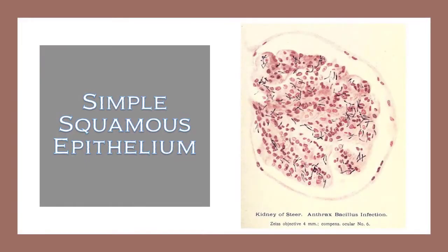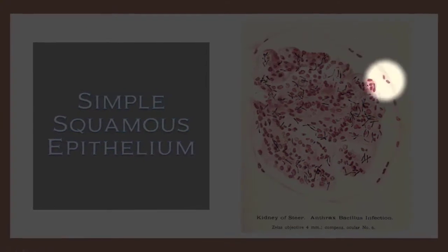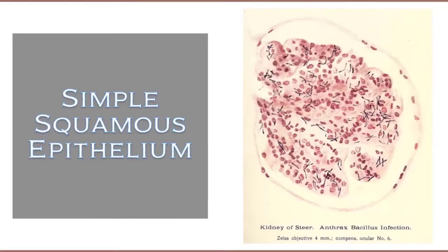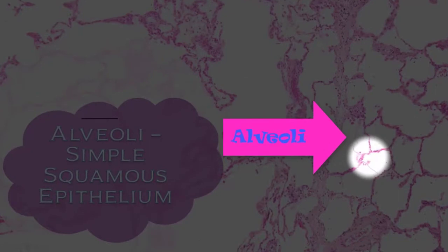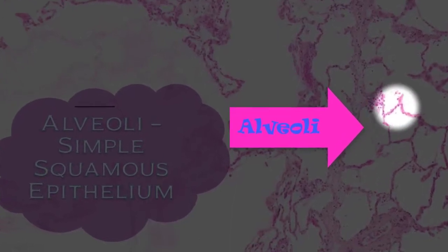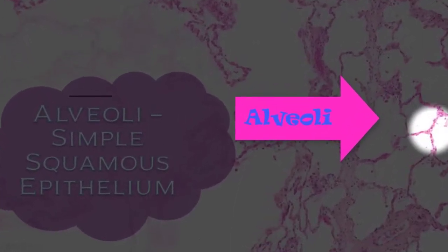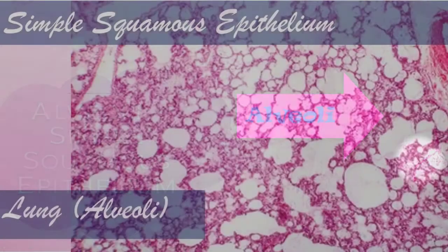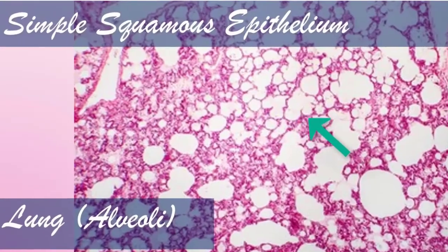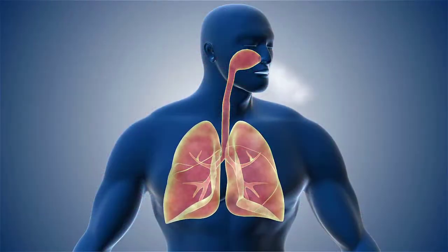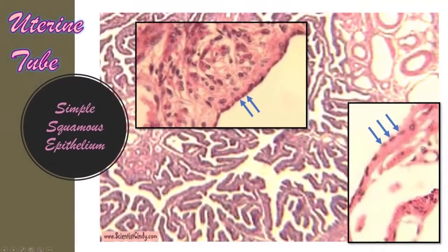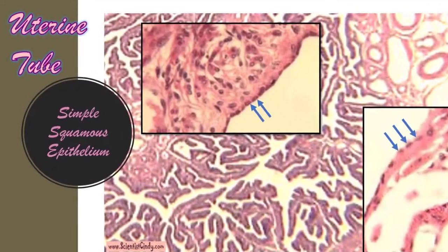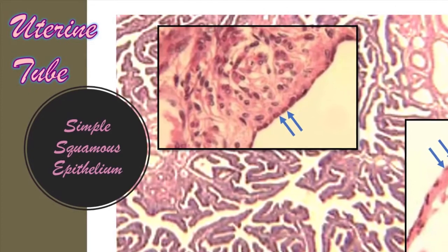We also have simple squamous epithelium that lines the Bowman's capsules in the kidneys. The alveoli of the lungs are also surrounded by simple squamous epithelium. This thin, single-layered tissue allows for gas exchange between the blood and the lungs. We also have simple squamous epithelium lining the uterine tube.